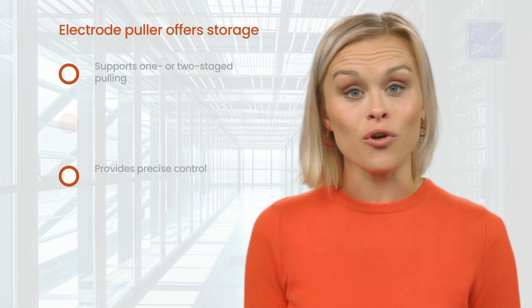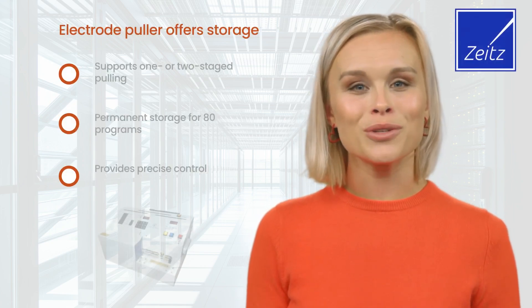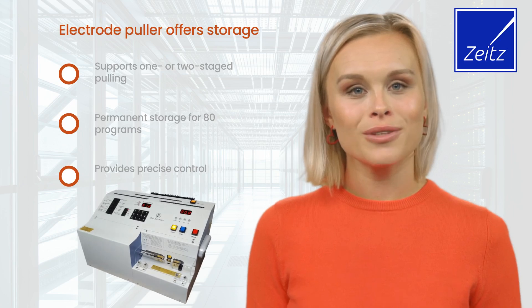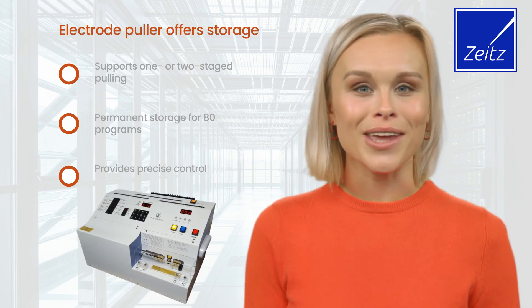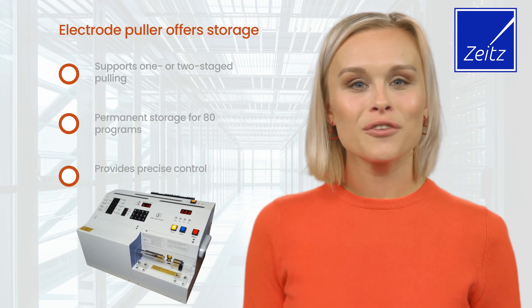Our electrode puller offers permanent storage for 80 programs and supports one or two staged pulling programs. This flexibility ensures that all variables can be set independently, providing precise control over your experiments.